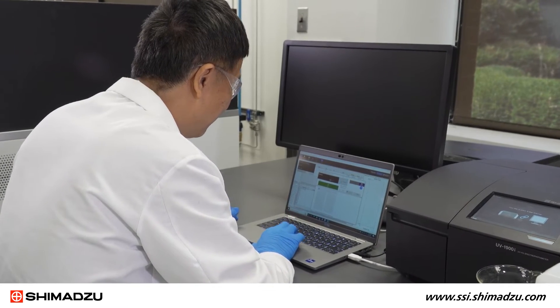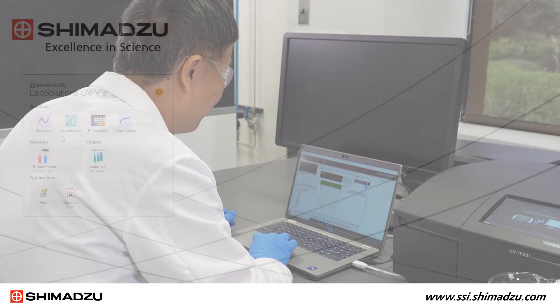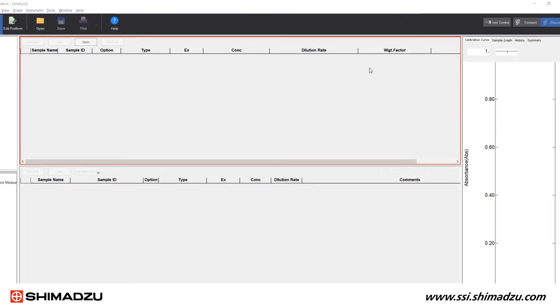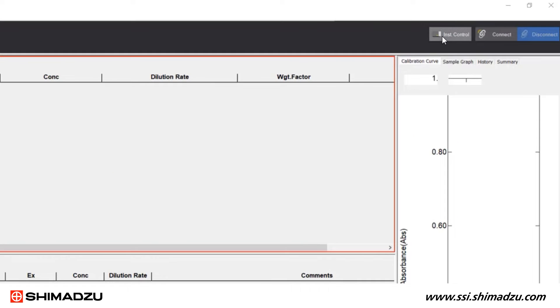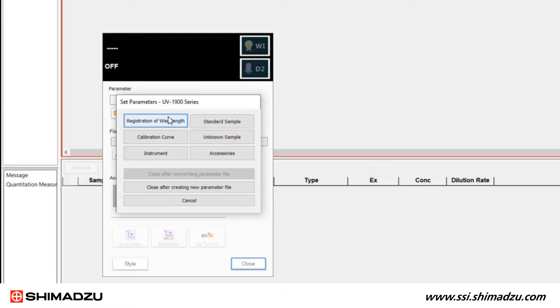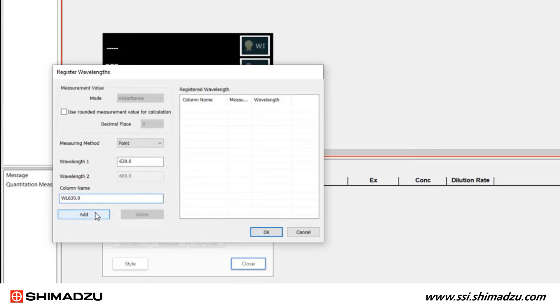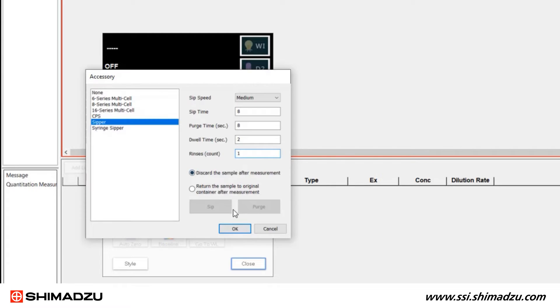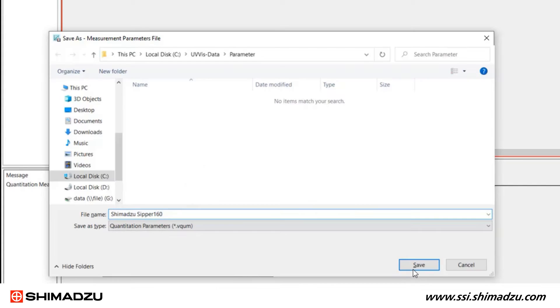Launch the LabSolutions UV-Vis software. Click the Quantitation tab to start the Quantitation module. Inside the Quantitation module, click Instrument Control, then click Edit in the pop-up window to set up a parameter file for quantitation. Register the measurement wavelength, set instrument parameters, and don't forget to select the appropriate sipper in the Accessories setting and set parameters for sipper operation. Save the parameter file.